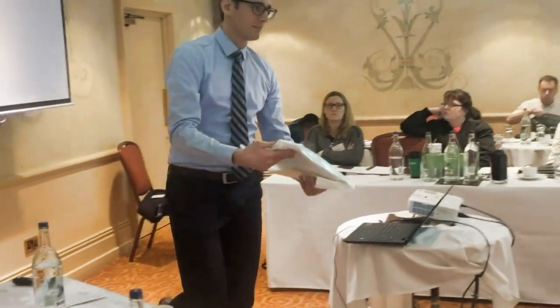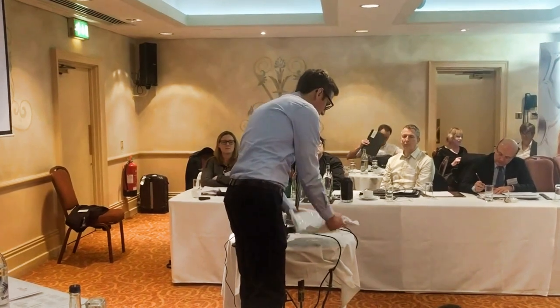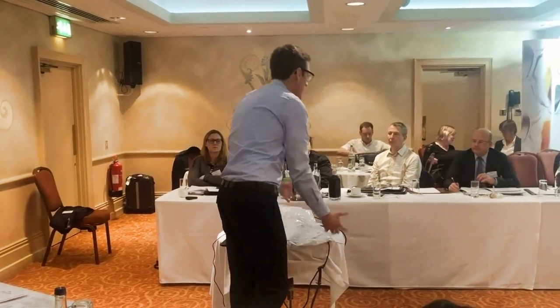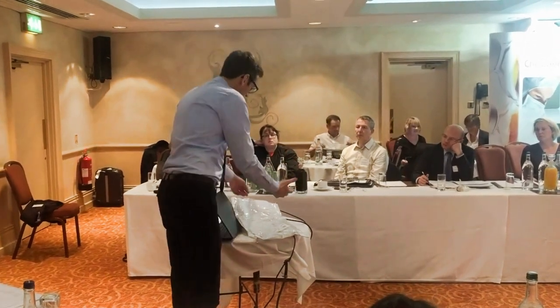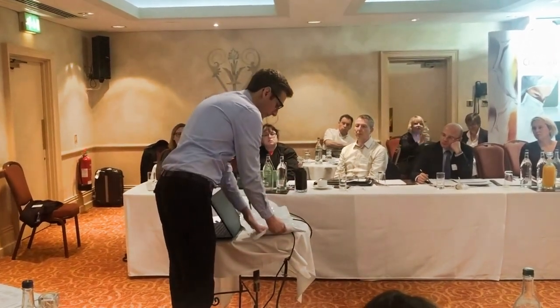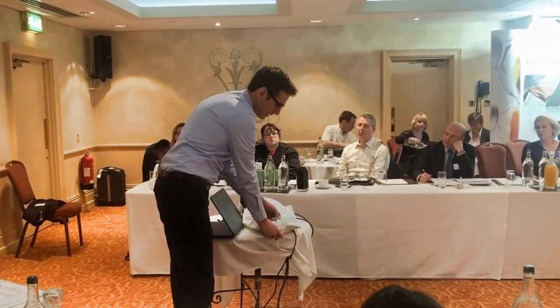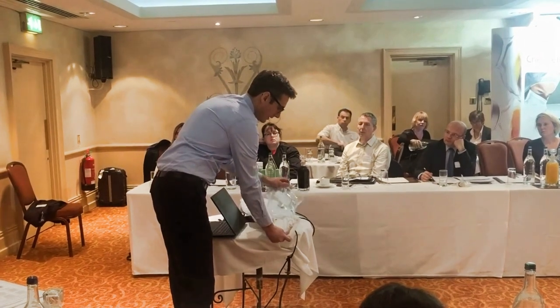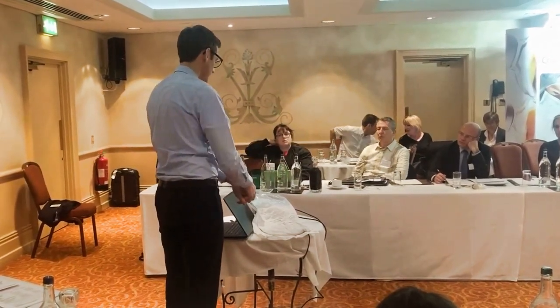when we open the pack, to try to minimize any contamination, which might mean to wear gloves when gowning, and to, for example, disinfect gloves after we open the pack, because the outside might be contaminated. So that would be an important step where we disinfect our garments.